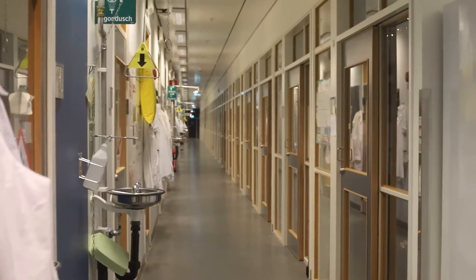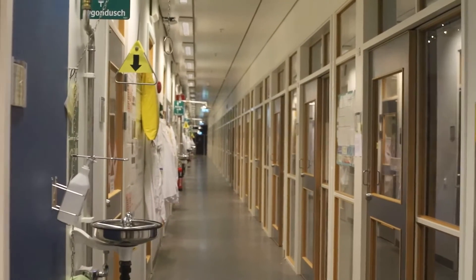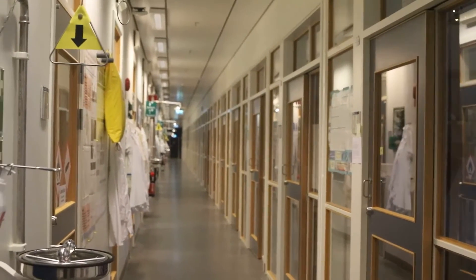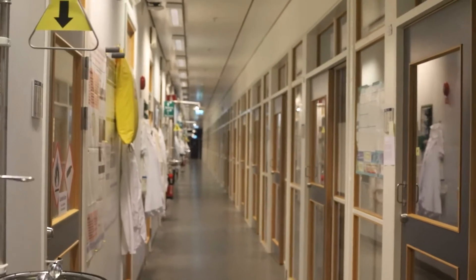Well, we reach to the corridor that in the right side we have the offices of researchers, and to the left side we have the labs.